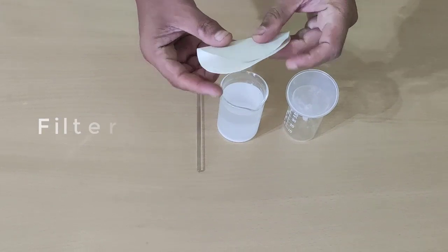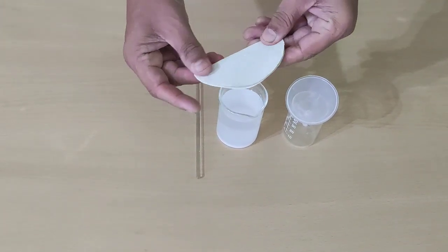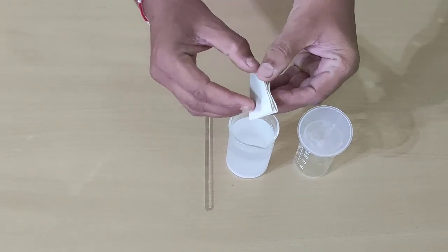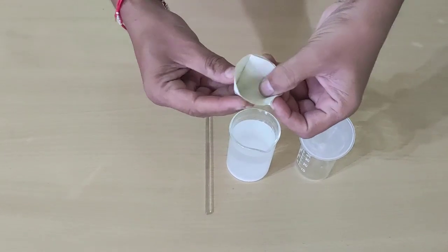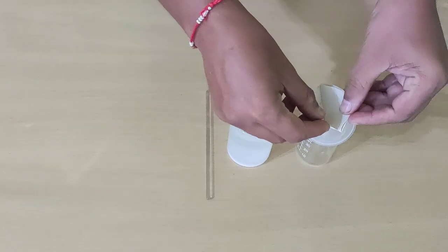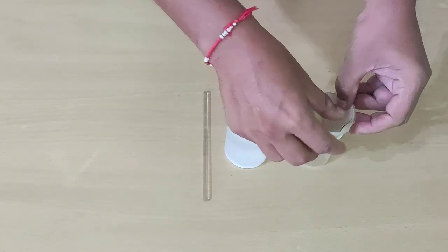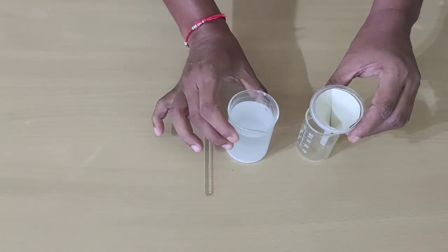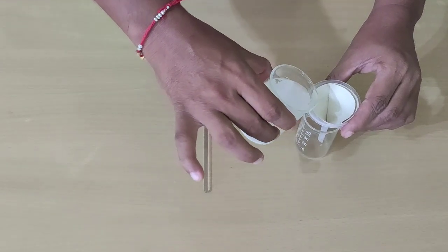We will fold it in half, one more fold in this half, and then we will get a cone shape like this. Then we will fit it in this funnel and slowly pour this solution.